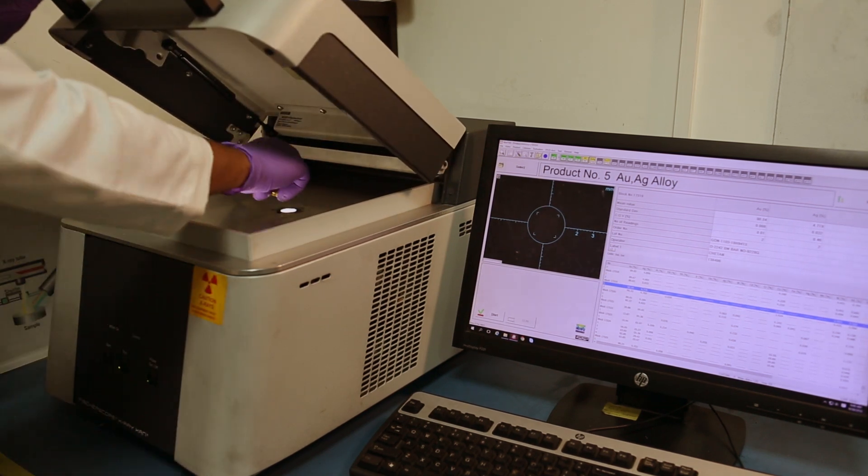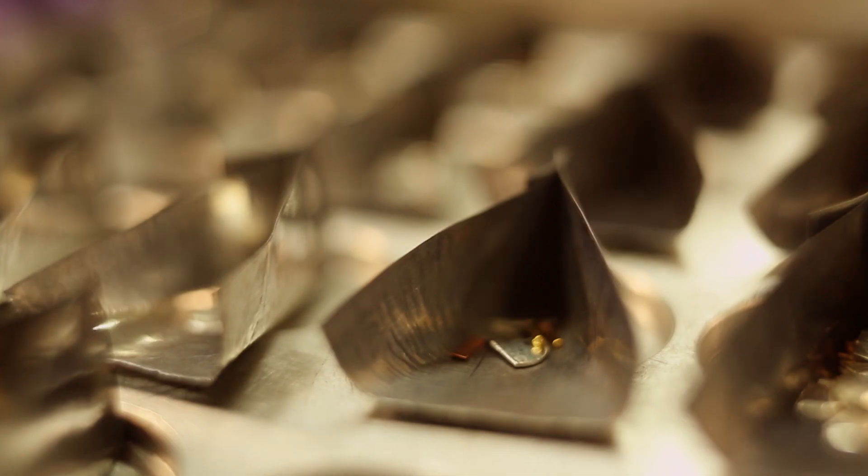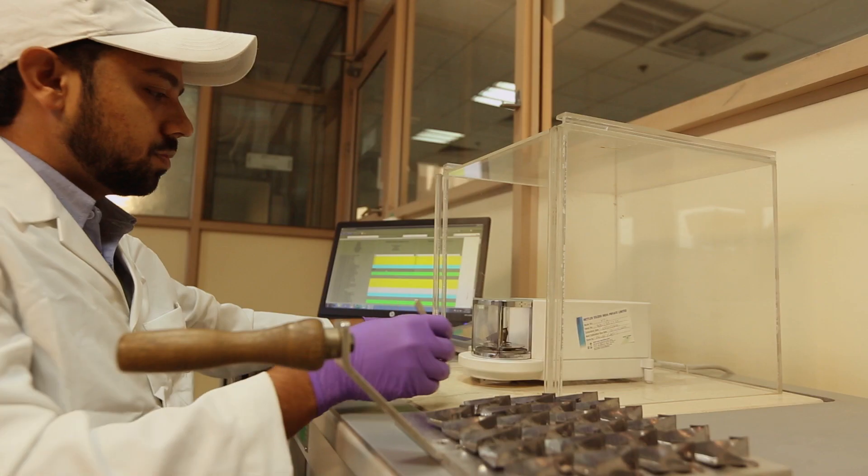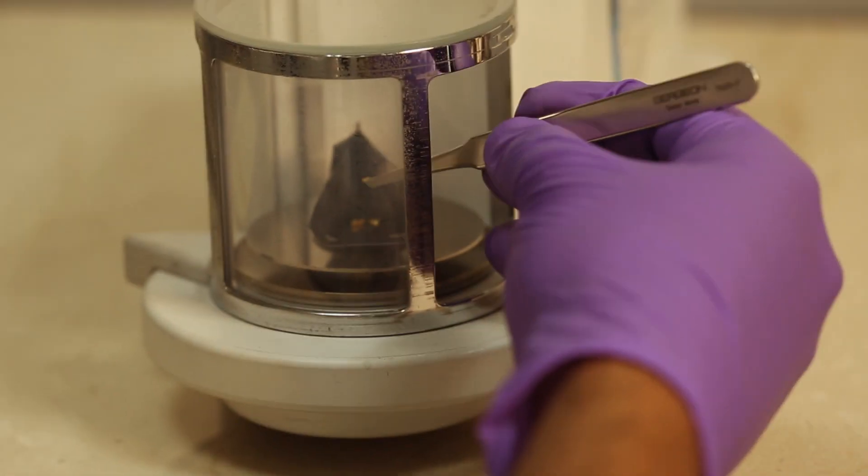A preliminary analysis of the sample is done on an XRF machine and its composition is determined. On the basis of this analysis, calculations for quotation are done and the samples are weighed on a highly sensitive analytical balance.